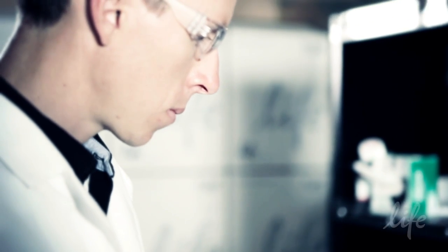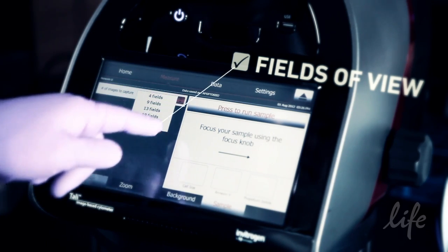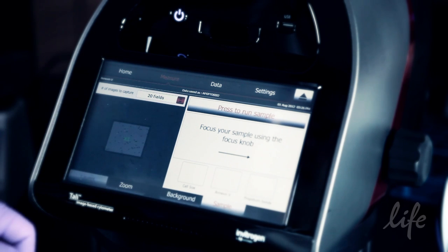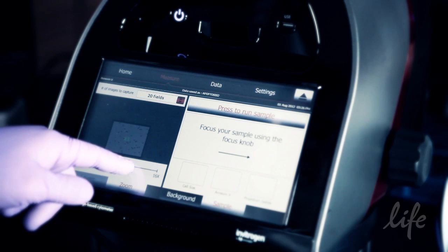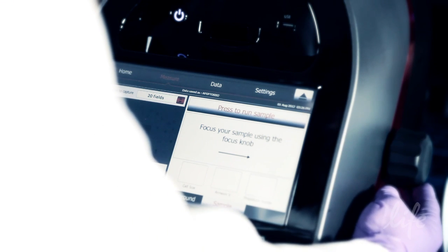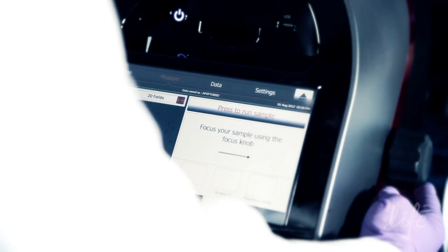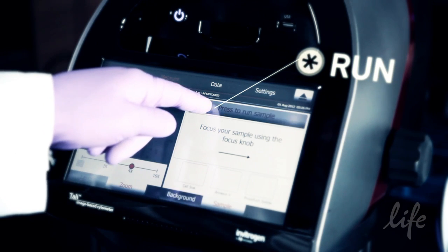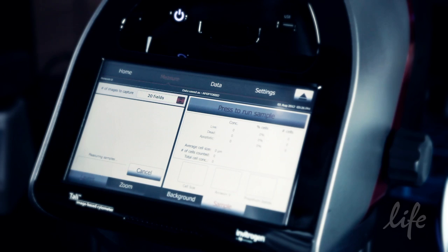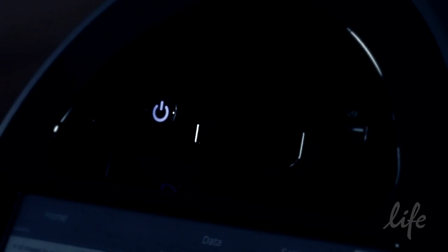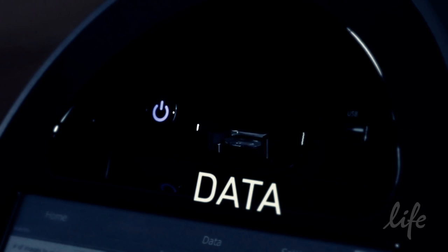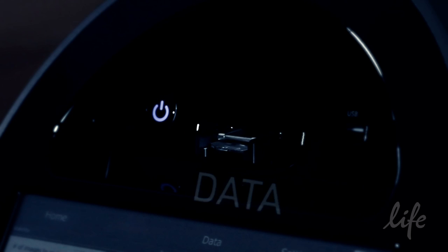To specify the number of fields of view to capture, touch the arrow button on the number of images to capture drop-down menu and select from the available options. The more fields of view analysed, the more powerful the statistical analysis. Touch press to run sample. After analysis, the Tali automatically ejects the slide and provides data from the analysis of the captured images in the sample tab.